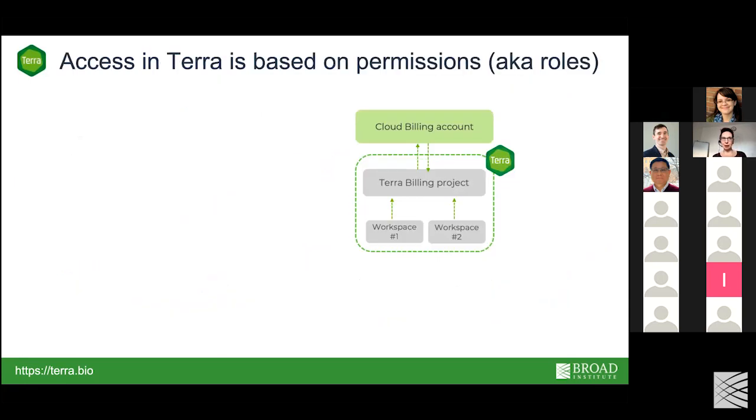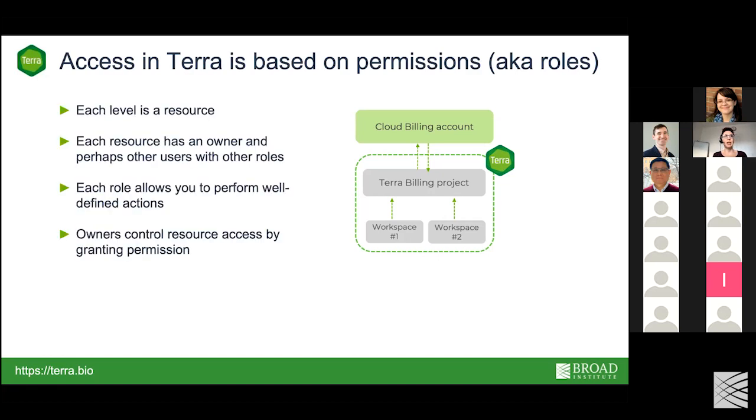So access in Terra to all of these resources, and additional resources like data, which I'll talk about, is based on permissions or roles. Each level in this hierarchy is a resource, and each resource has an owner and other users as well with other roles. Each role allows you to perform specific actions, and owners control the access by granting permission to other users. So that's the big picture.